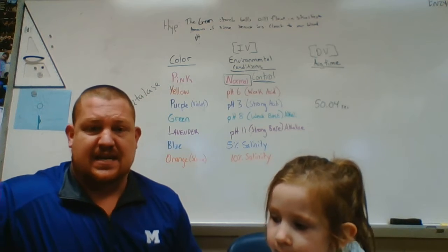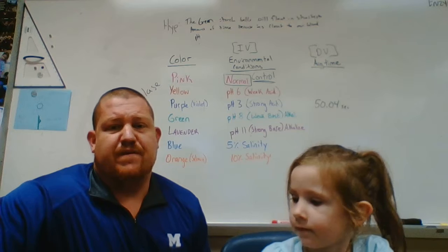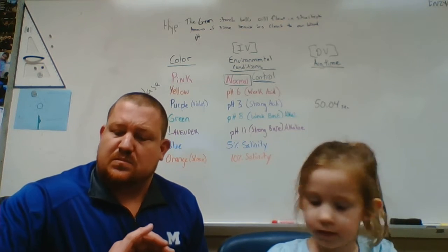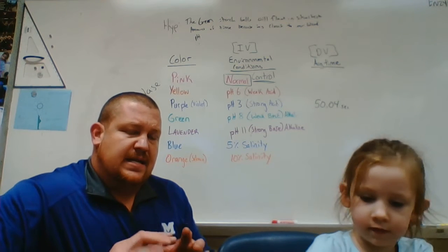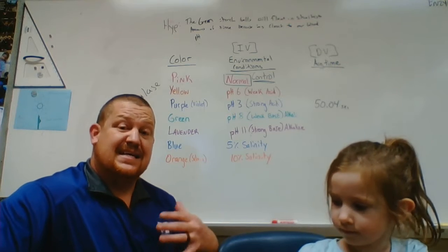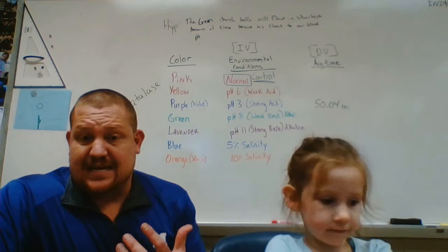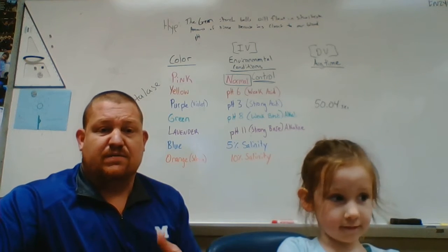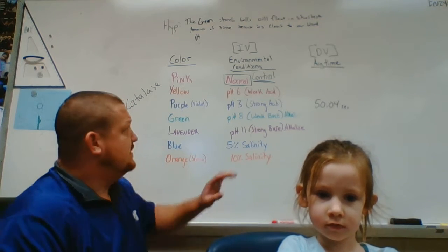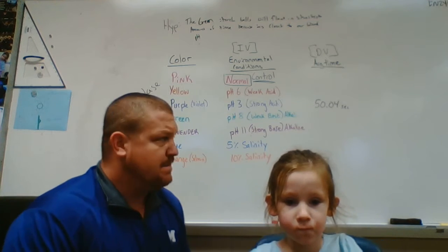Now, catalase is an enzyme found in our liver. It's also found in yeast. It can break down hydrogen peroxide. So what we're focused on, like we talked about the other day, is that enzyme function can be changed, right? Enzymes can be denatured. So depending on the environment that the enzyme or the protein is in, it may denature, right? So if we have a fever, it could denature the protein, it won't work as well. So we're studying some different conditions and how this affects the activity of the enzyme.